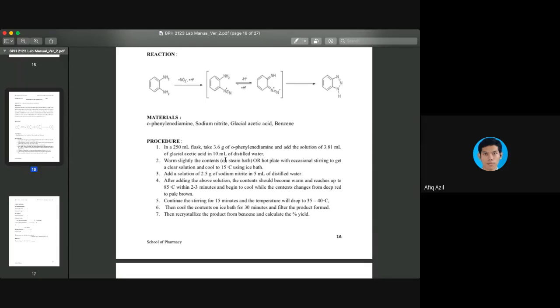That's why it is important to make sure that there is enough ice in the ice bath to keep the temperature low, because if you let the reaction happen at room temperature, it's going to increase to more than 100 degrees Celsius. It is an exothermic reaction, and there could be chances of explosion or things like that, because in an exothermic reaction energy is being released.